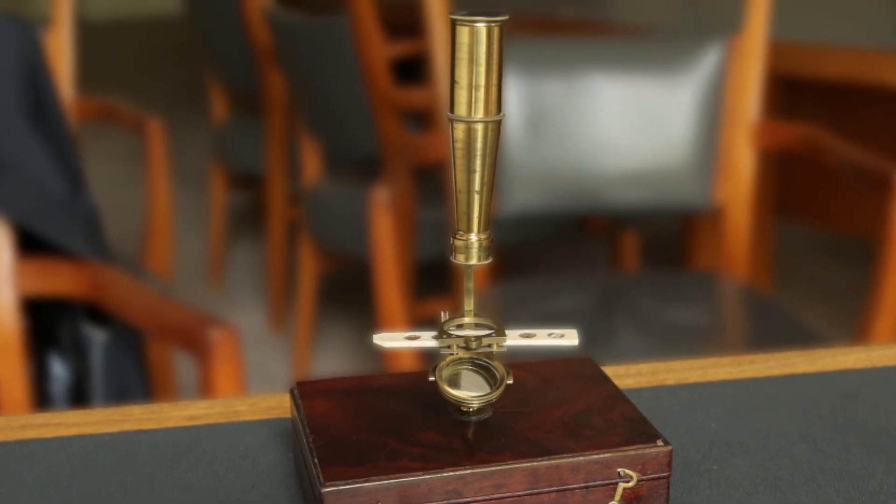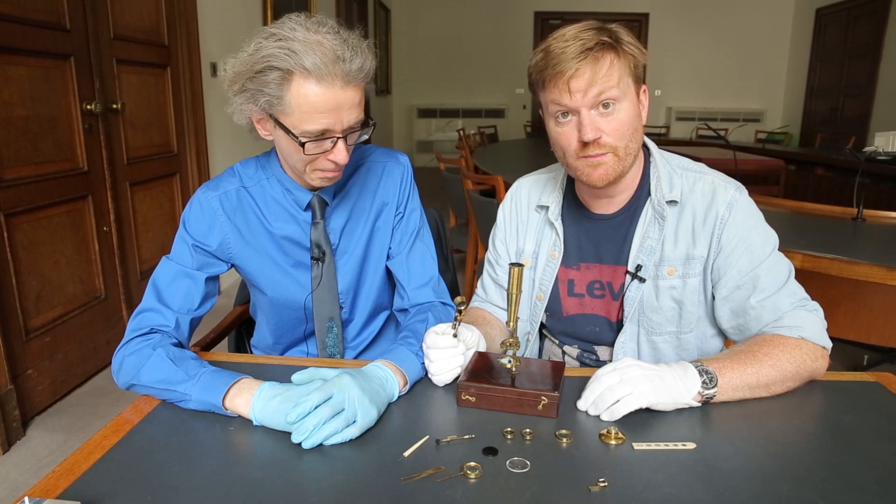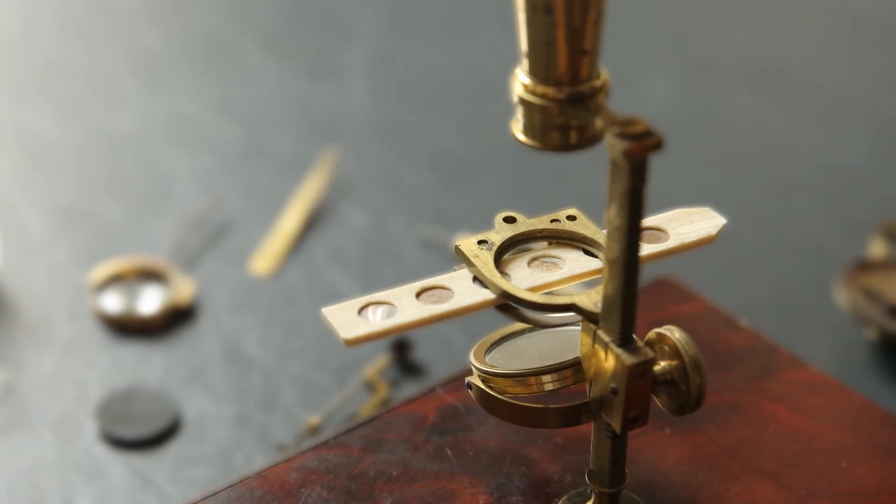So you have made an 18th century microscope. It's very sort of IKEA this, isn't it? I asked what was in the box — I got my answer. Two microscopes.